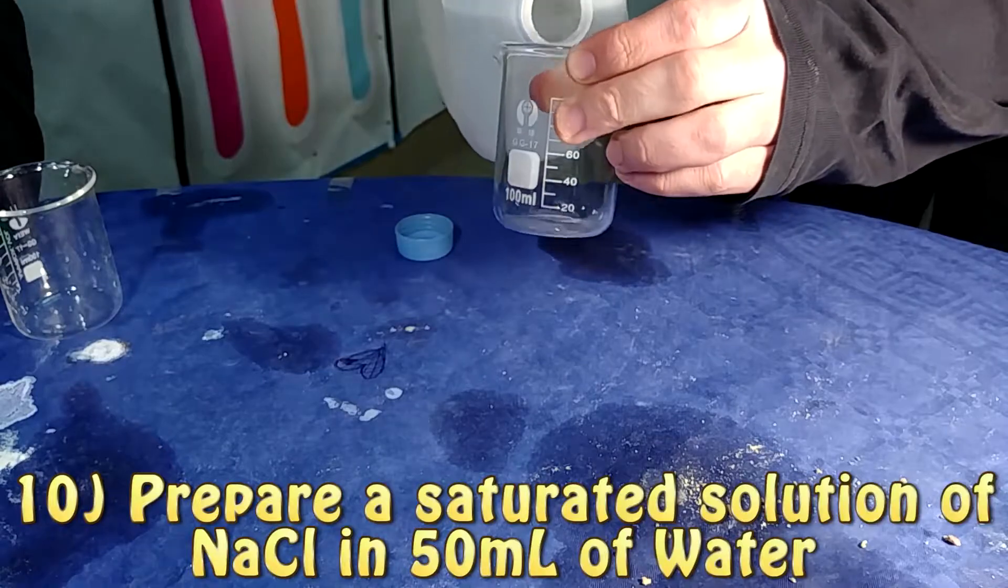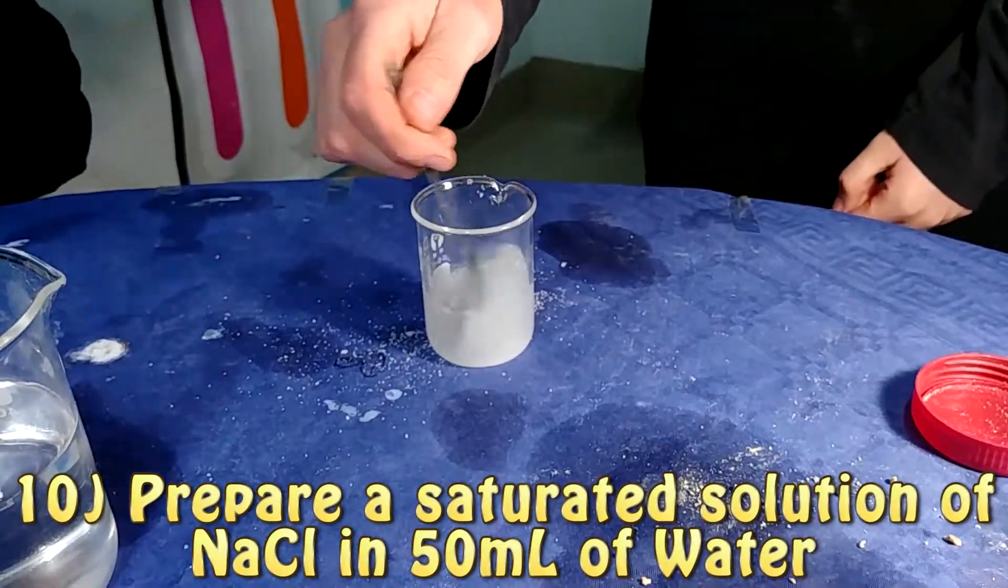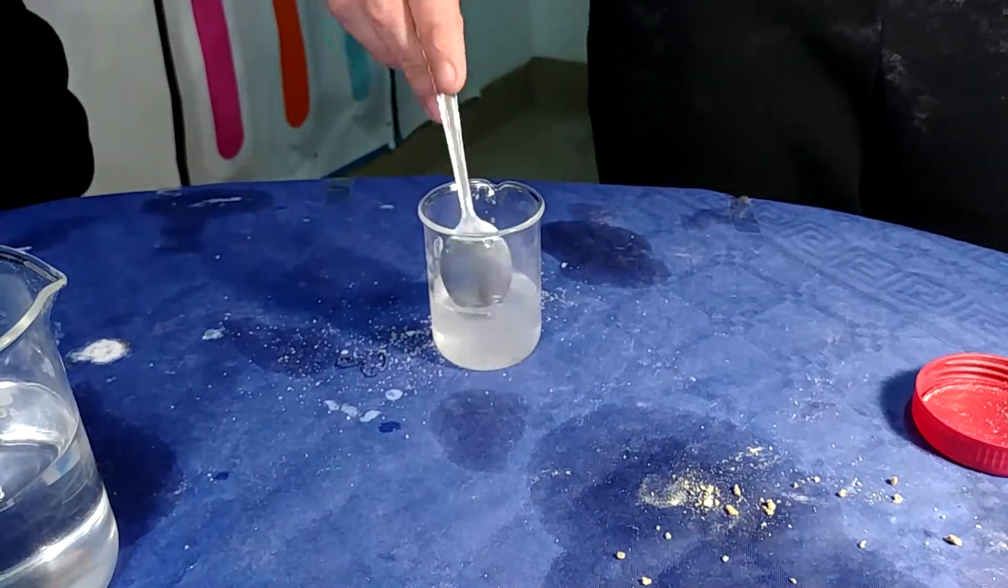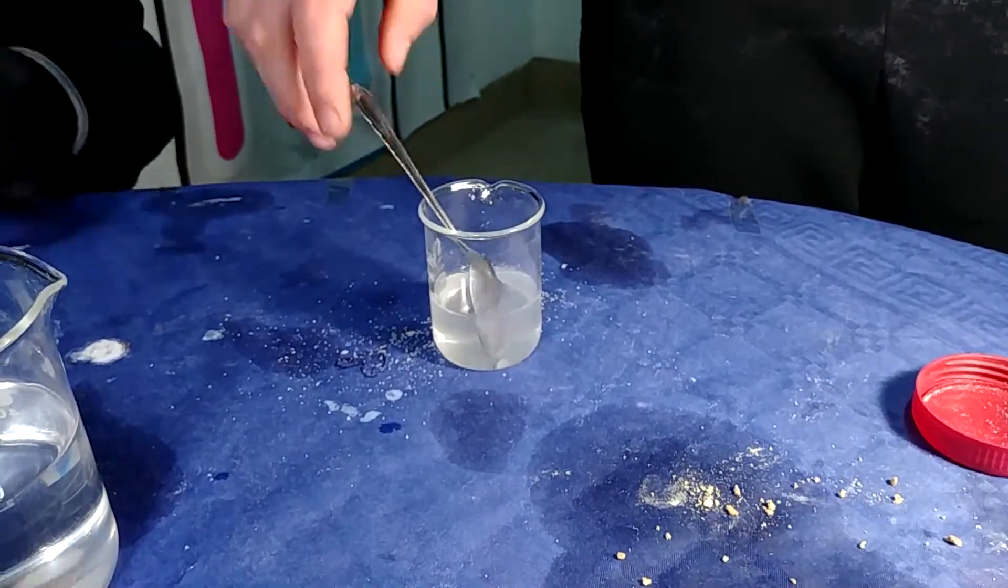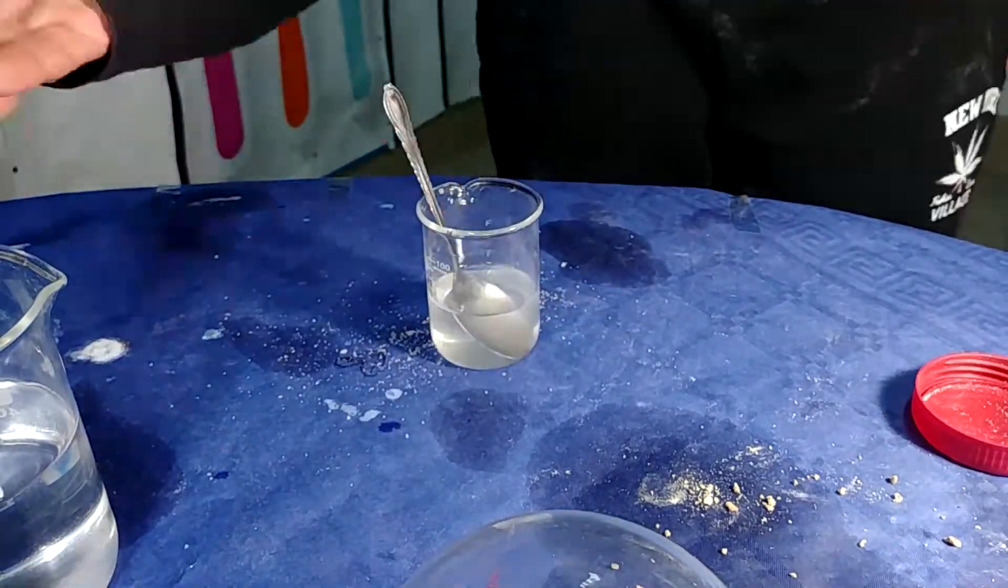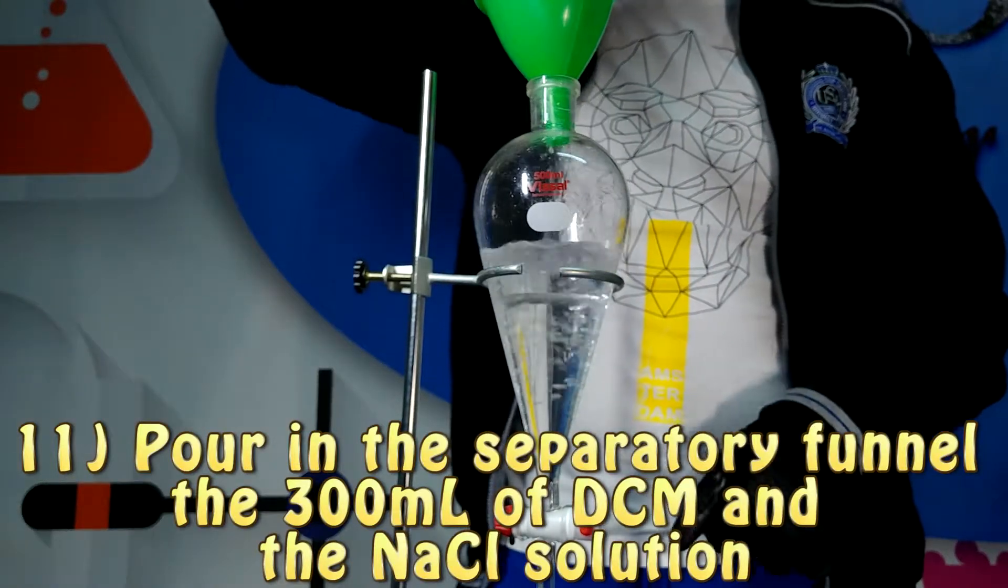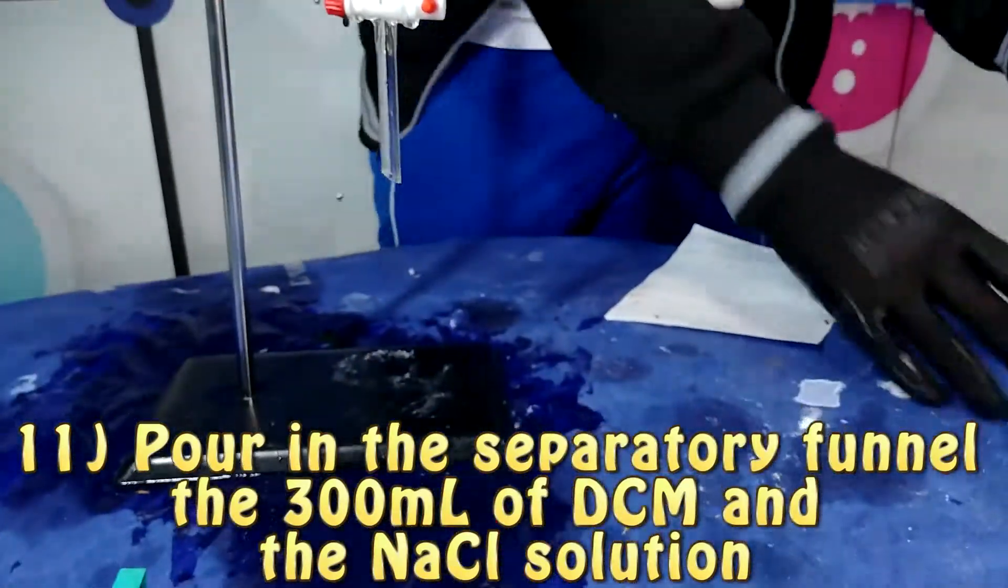So the next step for our experiment is to prepare a saturated solution of sodium chloride. Then we are going to add this solution to our separatory funnel where we find our dichloromethane. We are going to mix everything and then we are going to leave the two solutions separate from one another.